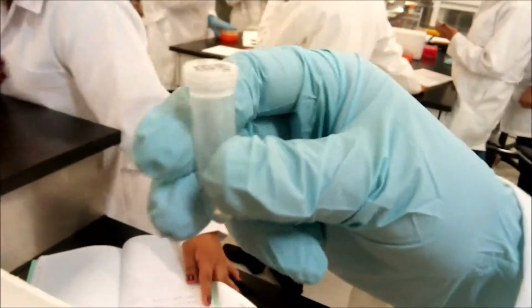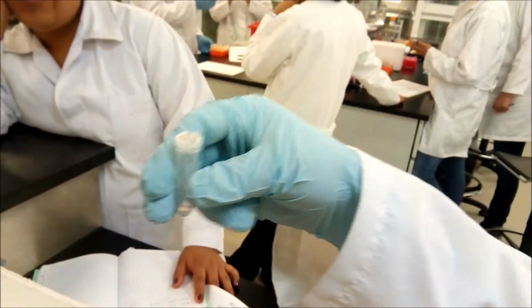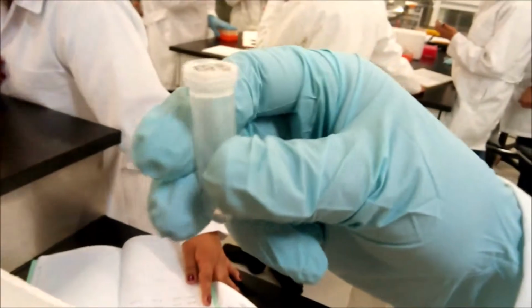Finally, with the primers used in practice, a PCR can be performed to know the sex of a person from whom only one sample is taken. Thaw template DNA, 10x stock buffer solution and 50 millimolar magnesium chloride solution at room temperature and place on ice.